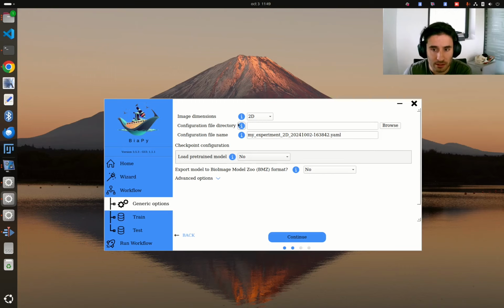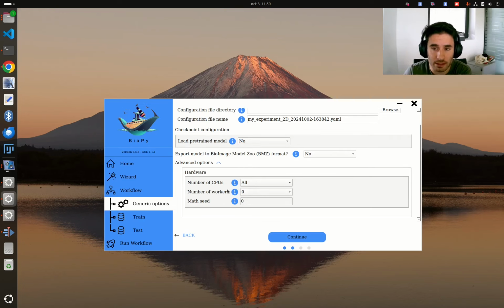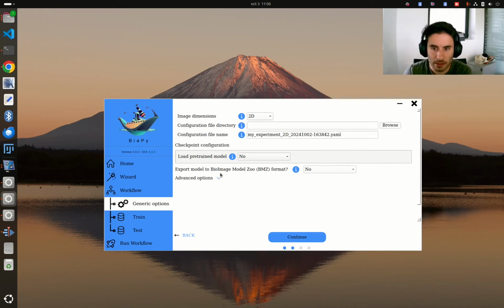For all the tabs the same format is preserved, meaning that we will have some basic configuration variables that you can touch, and also more advanced options. There are lots of variables here, but you don't need to touch all of them. Just with the basic ones you will configure a workflow with default settings that work really well in almost all situations.